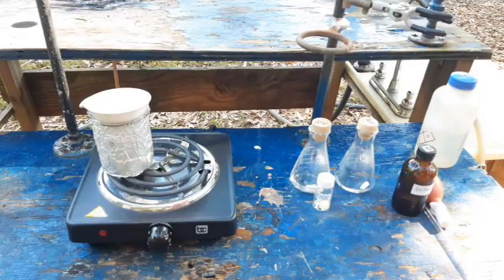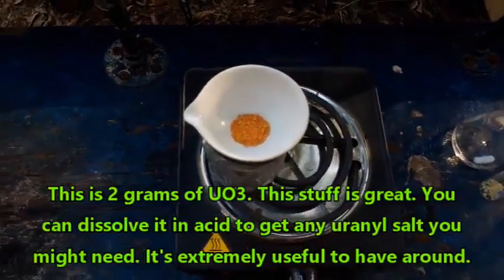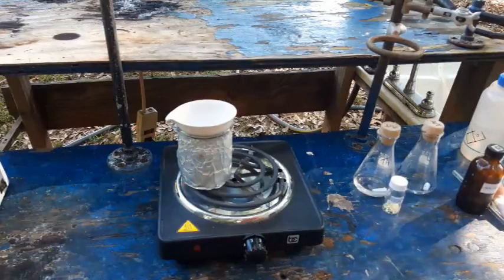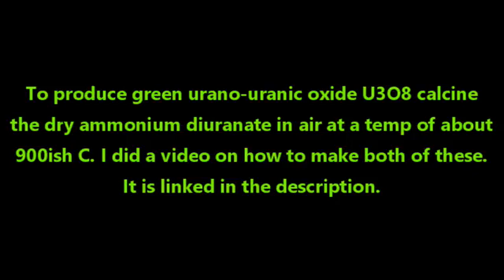For the uranyl complex, all the literature I can find says to start from uranyl nitrate, and all I've got right now is uranyl sulfate, so I'm going to make up a little bit of uranyl nitrate from uranium trioxide — see, I've got some here, it's very nice. Uranium trioxide is extremely easy to make: you dissolve uranium in nitric acid to create uranyl nitrate. The same trick works when recycling uranium — dissolve everything in nitric acid, add aqueous ammonia, precipitate out ammonium diuranate, filter it off, dry it, and calcine it at about 230°C until you get a nice lovely orange powder.